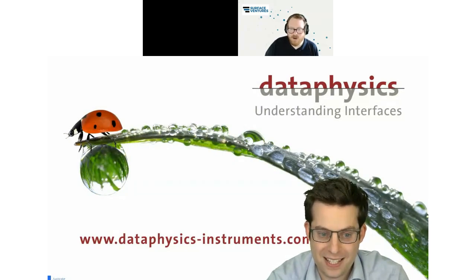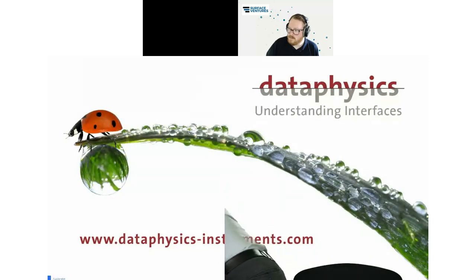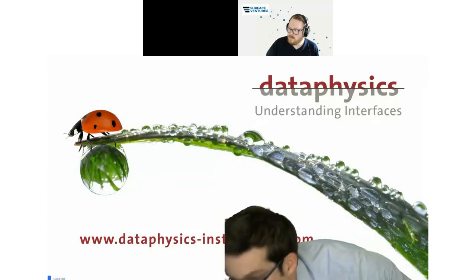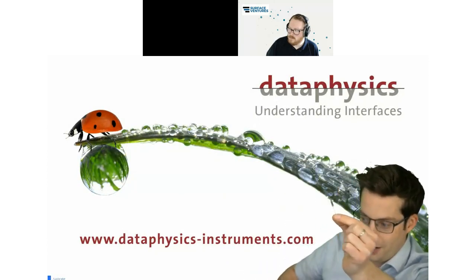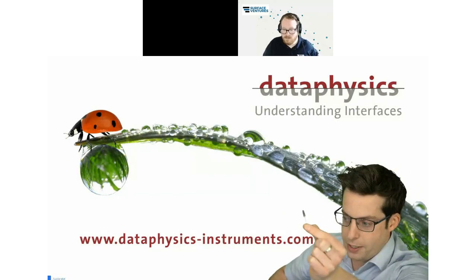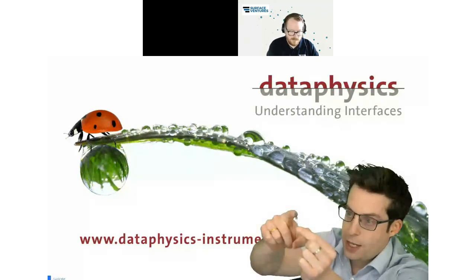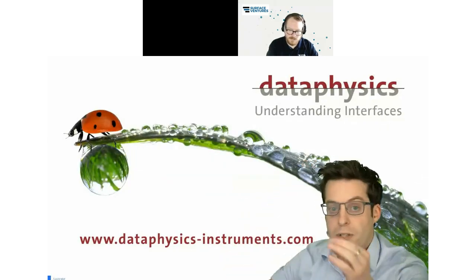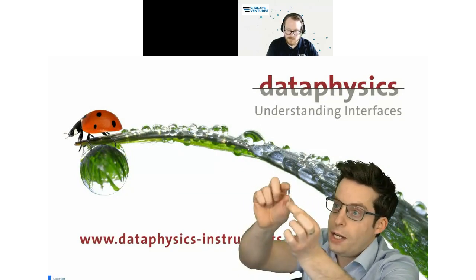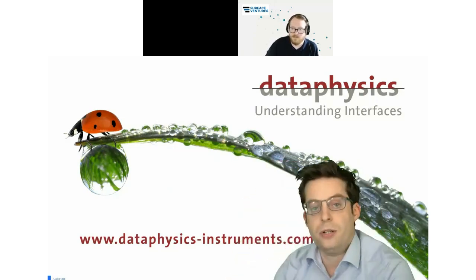So I had a question there regarding the implant. Why 8 millimeters immersion? Yep, this I also have to show you. Look, I hope you can see this a little bit. Now it's focusing on my face, but now you can see the implant. This implant that we are using here has a total length of 13 millimeters. But you see here at the beginning, it has around 5 millimeters of a conical section where I do not know the diameter very exactly. And only after 5 millimeters it becomes a homogeneous cylindrical surface.